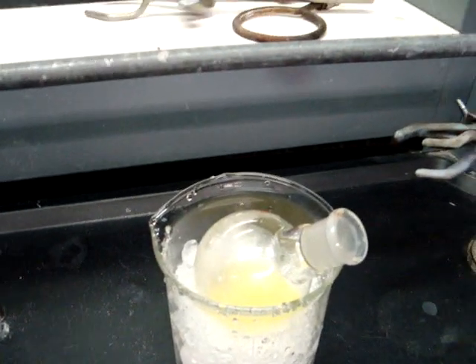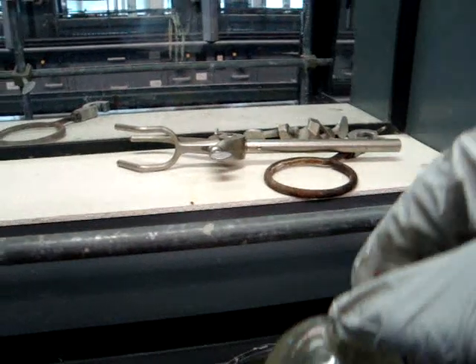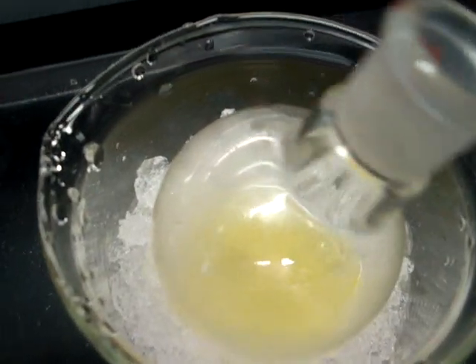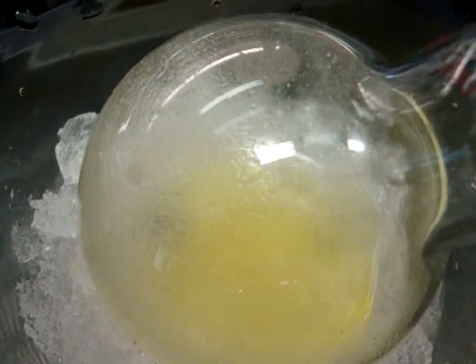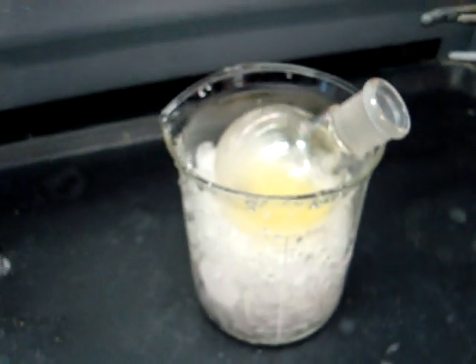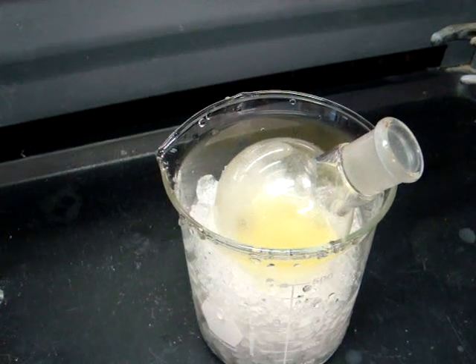Once you have refluxed for 30 minutes, remove the round bottom flask and place it into an ice bath for 10 minutes. As you can see, as it cools, the crystals are already starting to form. You will then use vacuum filtration to remove the solid from the solvent, weigh your yield, and calculate your percent yield.